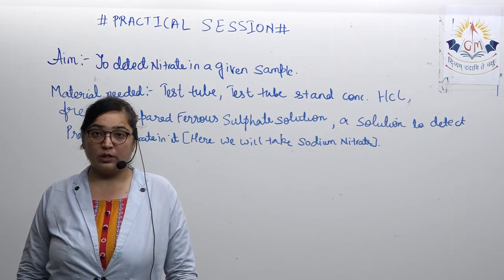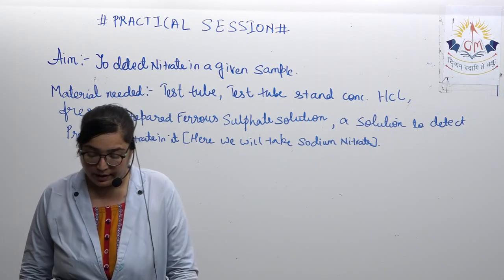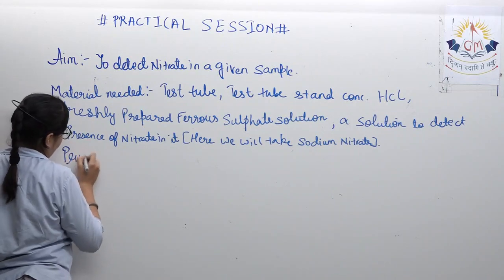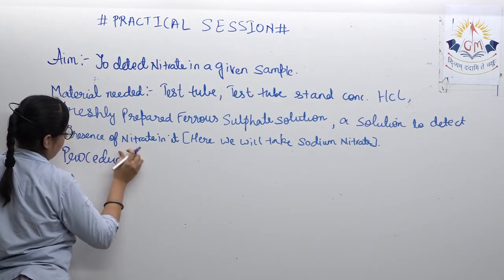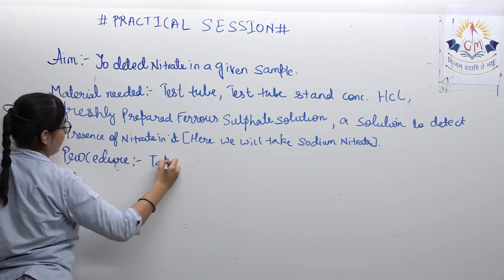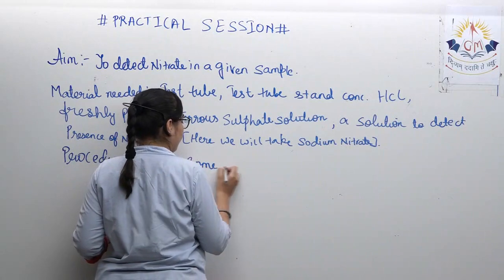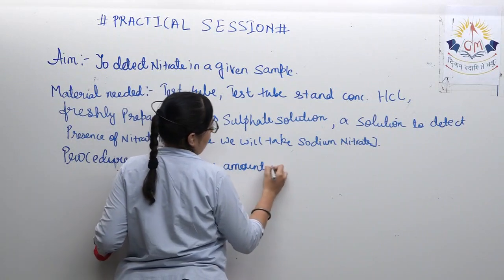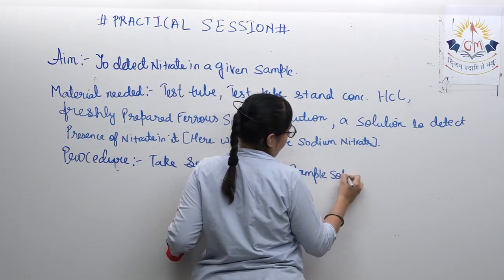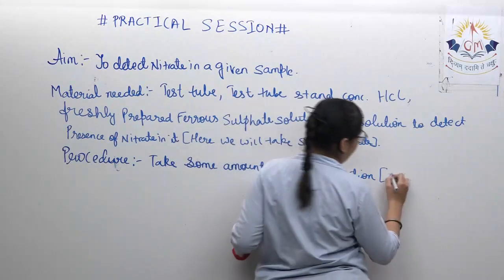How to do the particular experiment, that is the procedure. For that, take some amount of sample solution. We are going to take sodium nitrate over here.